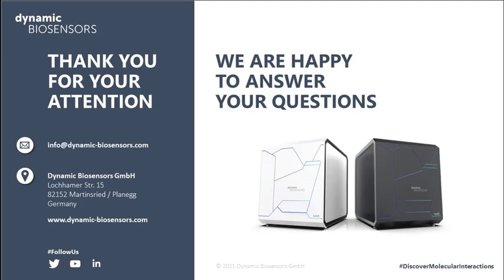Thank you. What is the lowest density you have to choose? If you're using a small molecule, for example, how low a surface density can you go with, and how do you know what that surface density is approximately on the chip?